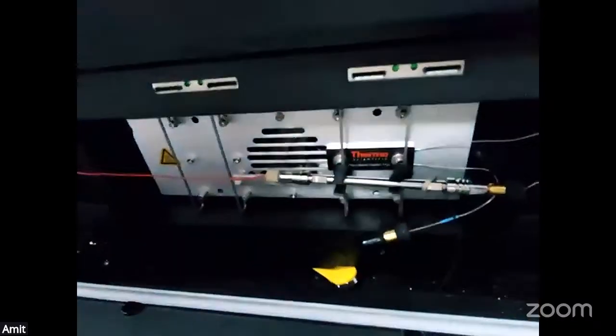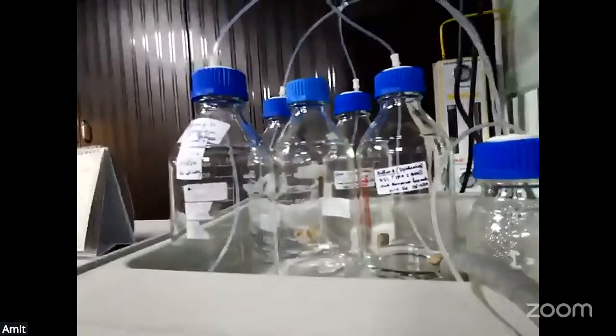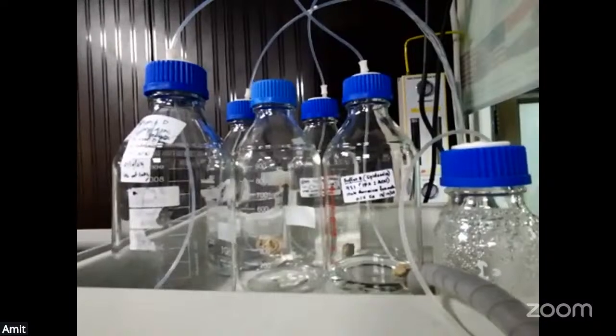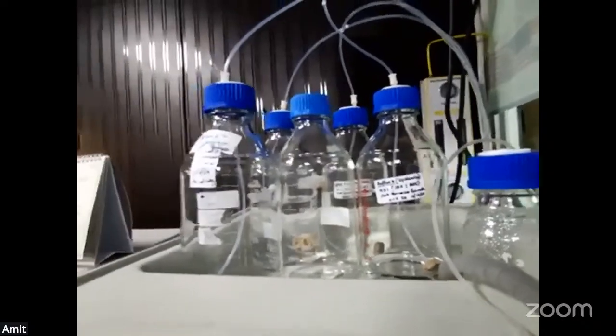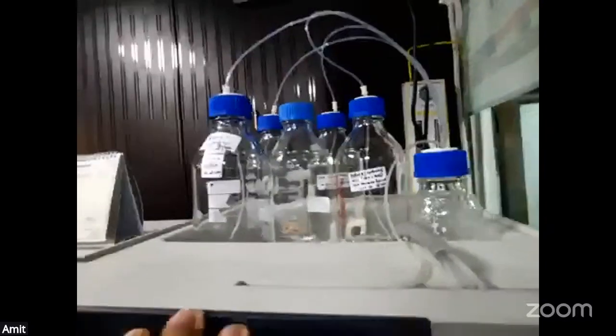Now coming to the solvent part, for lipidomic samples we use 4 different kinds of solvent. We use 2 different modes, the positive mode and the negative mode. In positive mode, we try to see the protonated ions, which could be protonated metabolites or protonated lipids. In negative mode, we try to see the deprotonated ions, which could be metabolites or lipids too.